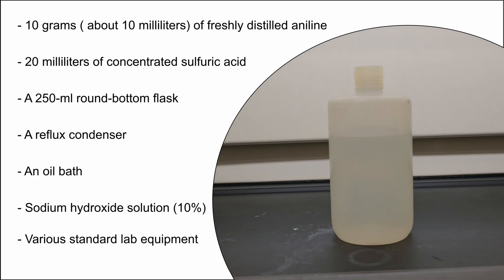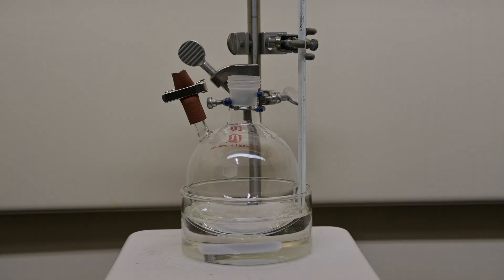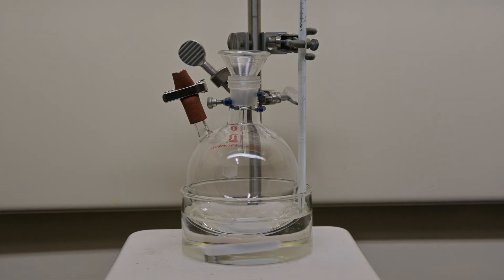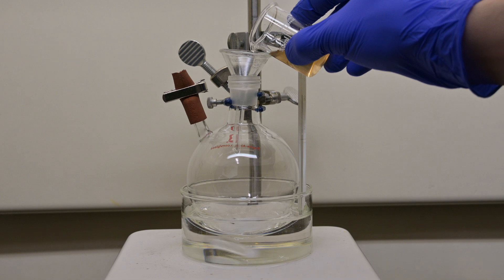You'll also need a sodium hydroxide solution, about 10%. First pour 10 grams of freshly distilled aniline into our 250 milliliter round bottom flask with a stir bar.